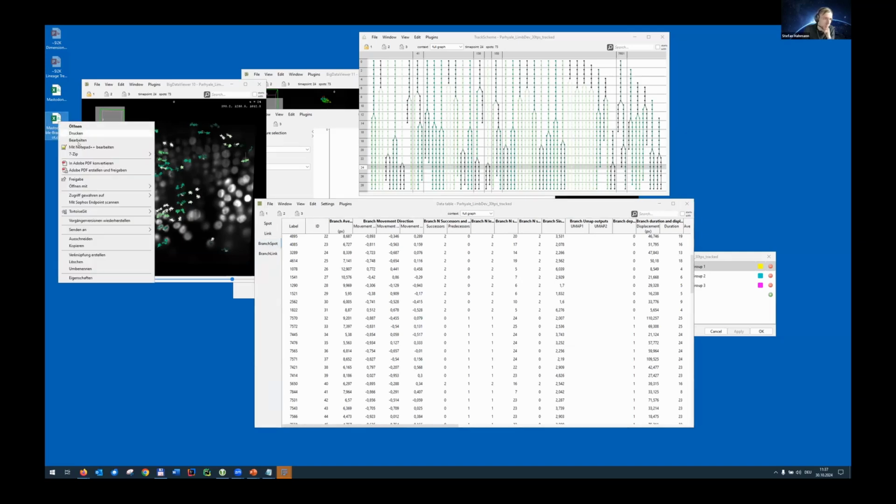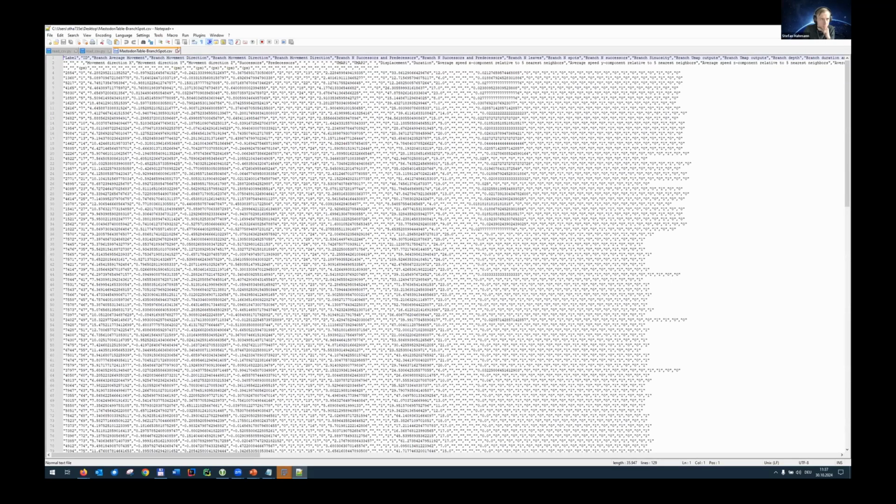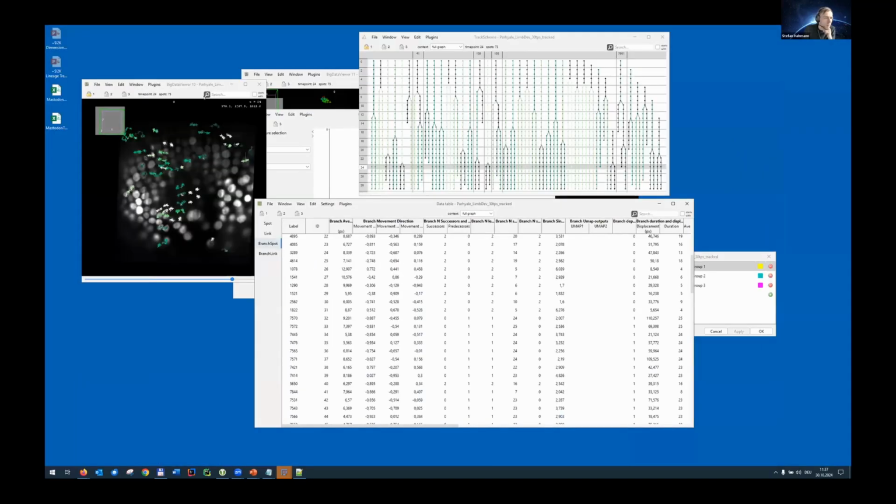This one. So, and the CSV file looks like this now. It's that data that you have that's to be seen in the table within Mastodon. Right. And yeah, the spot table as well. And you could use that, just as said before, in R, in Python, in a Jupyter notebook, or whatever you like to analyze the data.